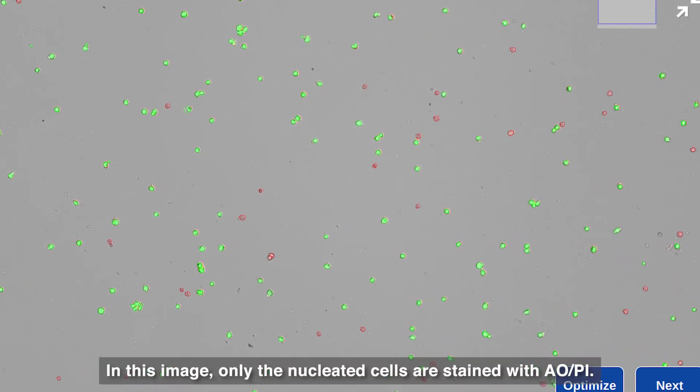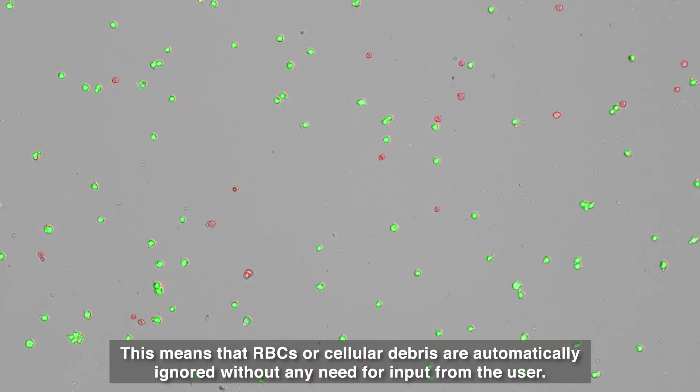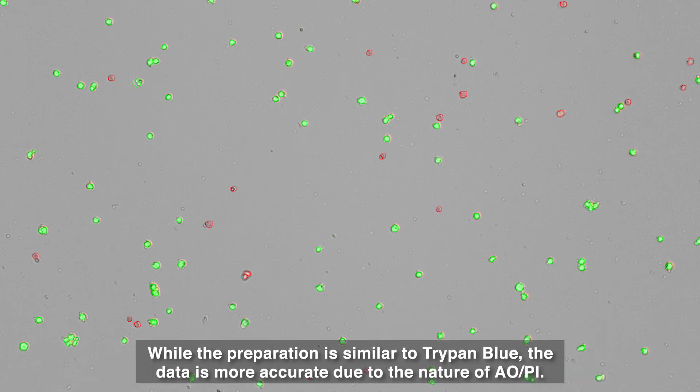In this image, only the nucleated cells are stained with AOPI. This means that RBCs or cellular debris are automatically ignored without any need for input from the user. The live cells will stain green, and the dead cells will stain red. While the preparation time is similar to trypan blue, the data is more accurate due to the nature of AOPI.